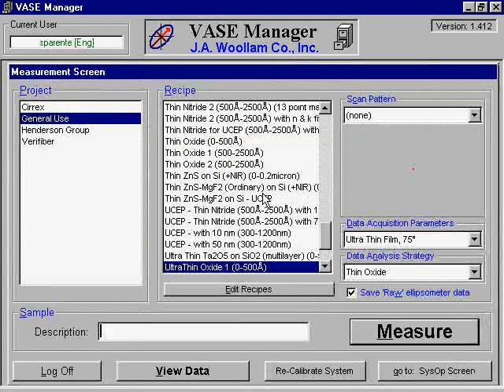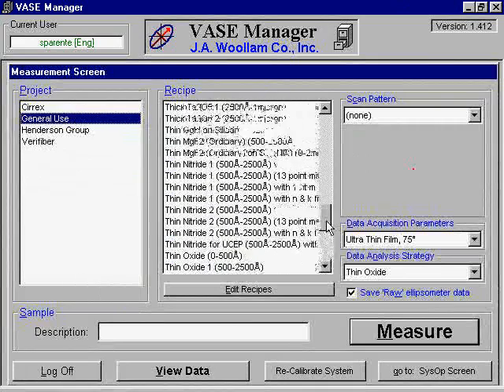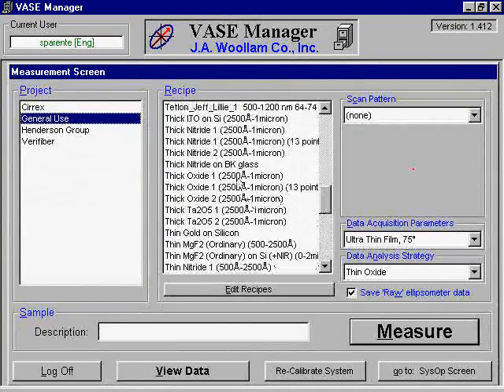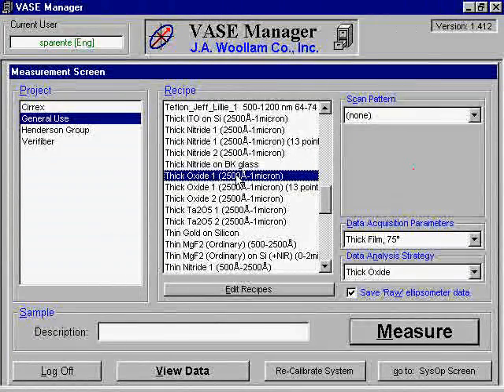Now you will need to configure the software. The Woolen software will ask you to make several choices. For the project setting, you should choose general use, unless your group has its own specific project. For the recipe setting, select the recipe that best fits the sample you wish to analyze. Keep in mind the type of substrate, the type of film, and the appropriate film thickness.